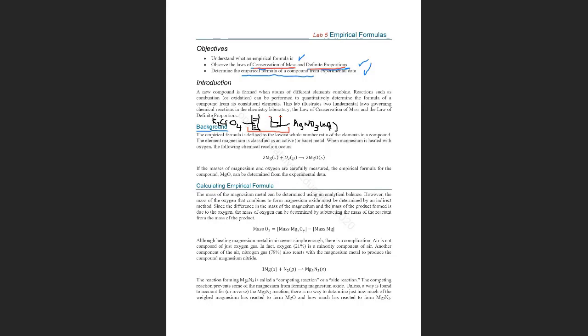We have them separately. Let's say I look at the analytical balance, I take the weight, and it shows, just to give you an example, 104.5 grams. Very good. Now I want to make sure that the law of conservation of mass is true.